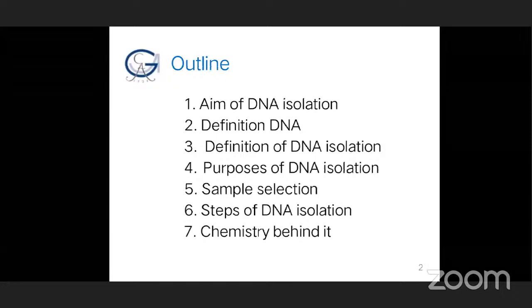Next is sample selection for the extraction of DNA. Which sample? Blood, tissue, virus, bacteria, etc. These samples are used for the isolation of the DNA. And last part is steps of the DNA isolation, means standard operating procedure of the DNA isolation. These steps are given in your journal, page number 187. That is the DNA isolation from blood and tissue.